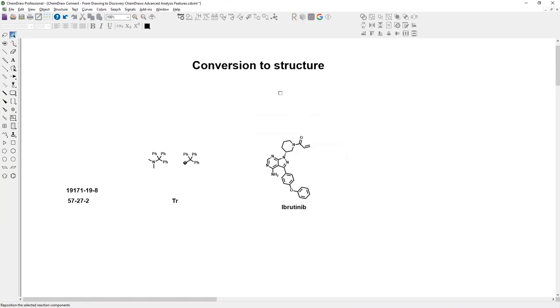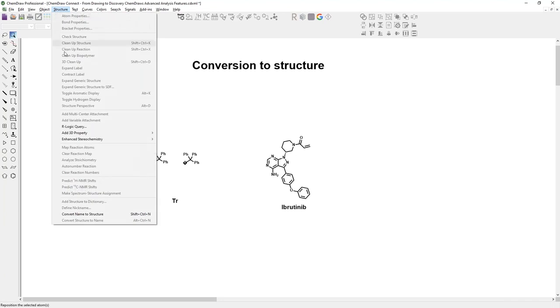And maybe it's a good time also to highlight here that you can also go beyond that and add your own structures to the dictionary. So the next time you have an intermediate, a very special structure that is not yet in this central repository, you can draw it one more time and add that structure to the dictionary, give it a name, and then retrieve it the next time from that name.